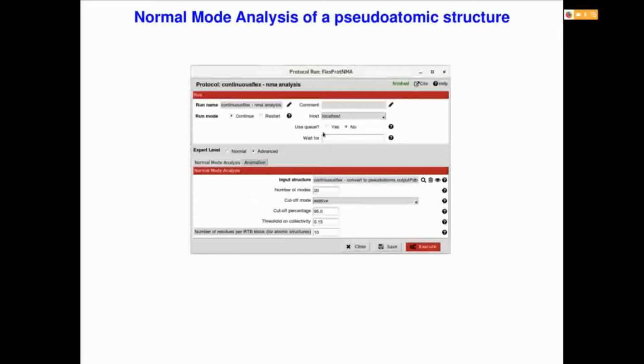And then it is very important to understand that we are actually using two different approaches for normal mode analysis for atoms and for pseudoatoms. For pseudoatoms, we are using what we call the Cartesian method, where the Hessian matrix is diagonalized, as I explained before in the slide before. For atoms, we are using another approach that is actually more suitable for big structures with a lot of atoms, a lot of points, like full atomic structures.